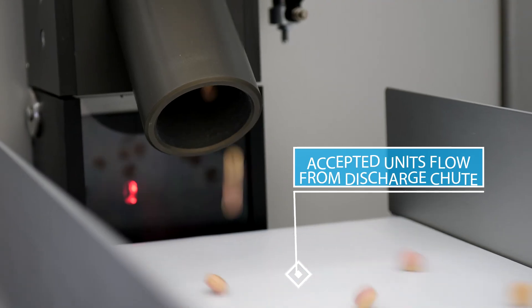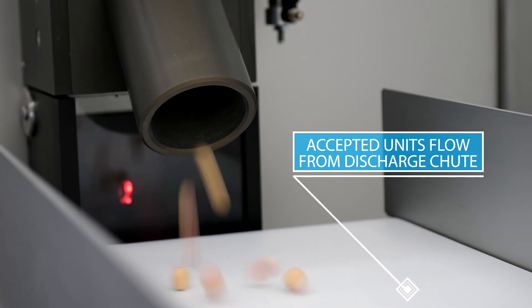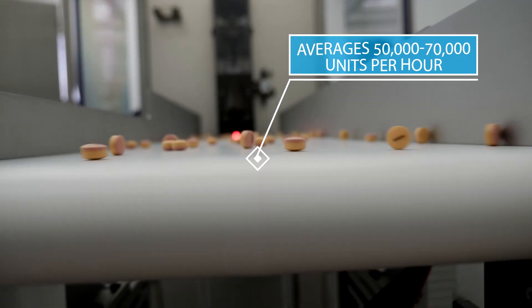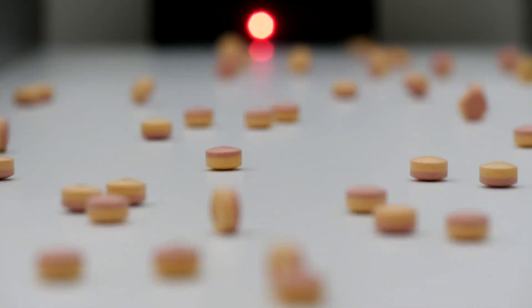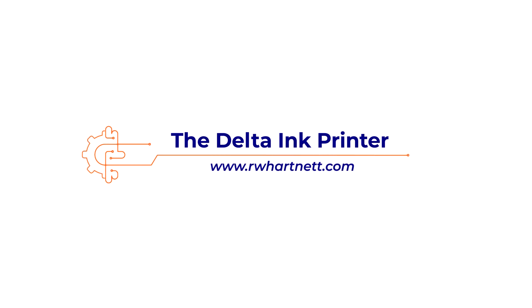Finally, accepted tablets are sent through the delivery chute where they are assembled for packaging with an average output of 50,000 to 70,000 units per hour. To learn more about the Delta ink printer, visit rwheartnet.com.